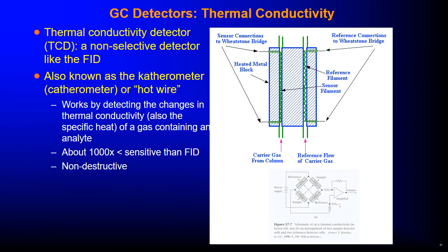So thermal conductivity. Thermal conductivity is also a non-selective detector, like the flame ionization detector. It works by detecting the changes in thermal conductivity of gases containing an analyte.